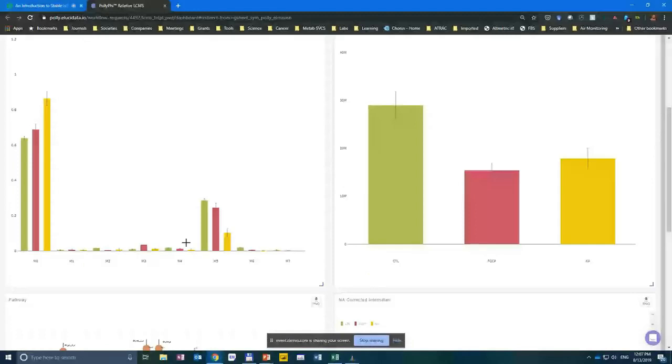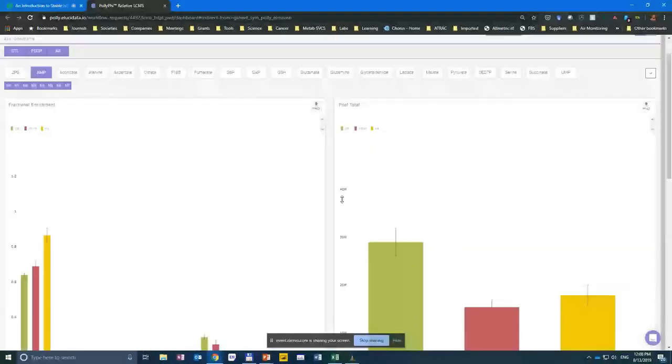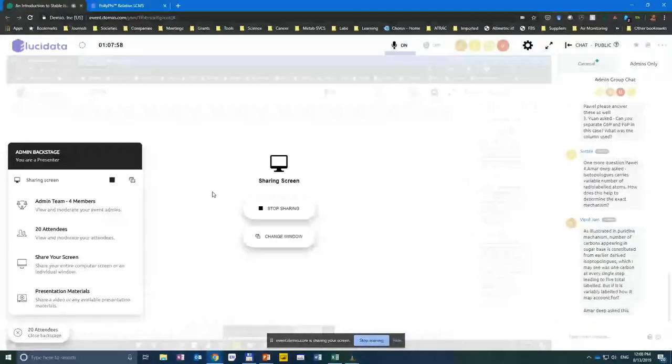Notice that there are other isotopologues, and that's true. There is labeling coming from other pathways, but the contribution can still be inferred. There are multiple publications on that. In fact, there is a very good paper from Hunter Mosley that models labeling of UDP-GlcNAc. Again, I will be happy to send it after this talk, but at this moment, I don't really have time to dwell into all the mechanisms. Of course, that's a longer discussion. Okay, do we have any other questions?